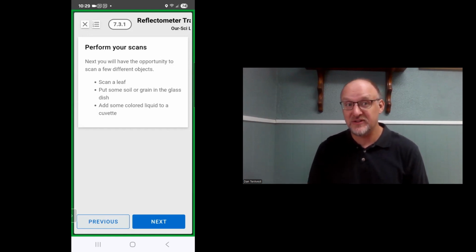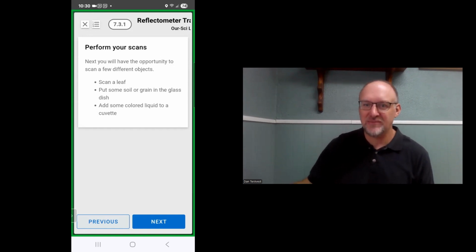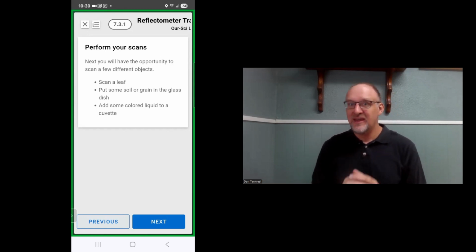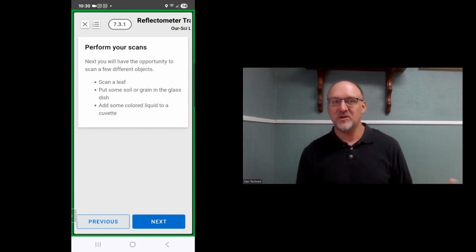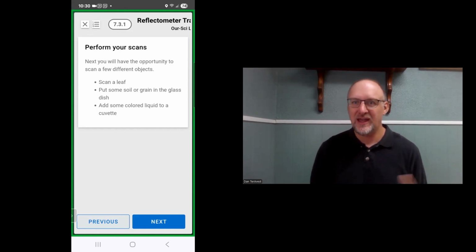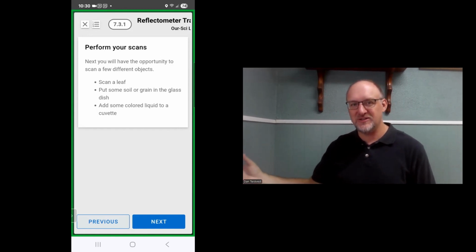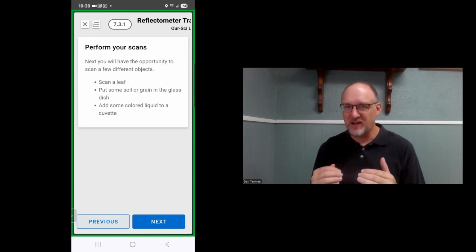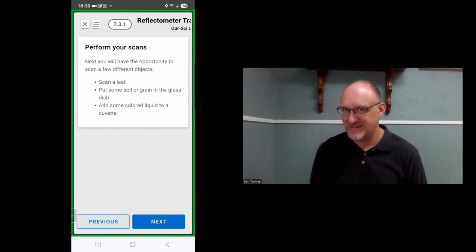The other thing to consider in the field is the sampling depth. You want to, as best as possible, match the sampling depth that was used for your calibration training data set. So if the training data set was using soils that were 0 to 10 centimeters deep, and you're sampling in the field 0 to 20 centimeters deep, that might cause an inconsistency and your model predictions may not be as accurate as you would like. So as best as possible, match those two. That's not always going to be possible.